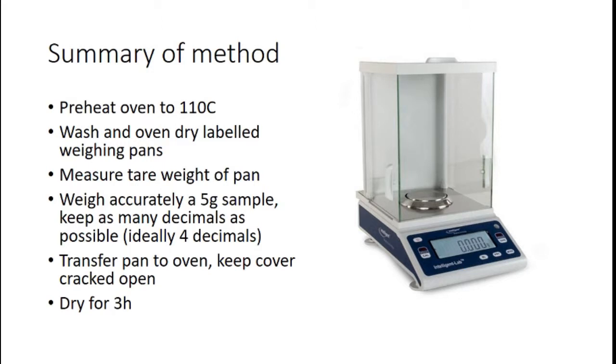So as a quick summary, you're going to have a lab oven. It's going to be preheated to just above 100 degrees Celsius. And the intent of that is that you are able to volatilize water off of that sample and other volatile components, and slightly above the boiling point, just in case there's bound water that's bound with colligative properties to a solute within that product.